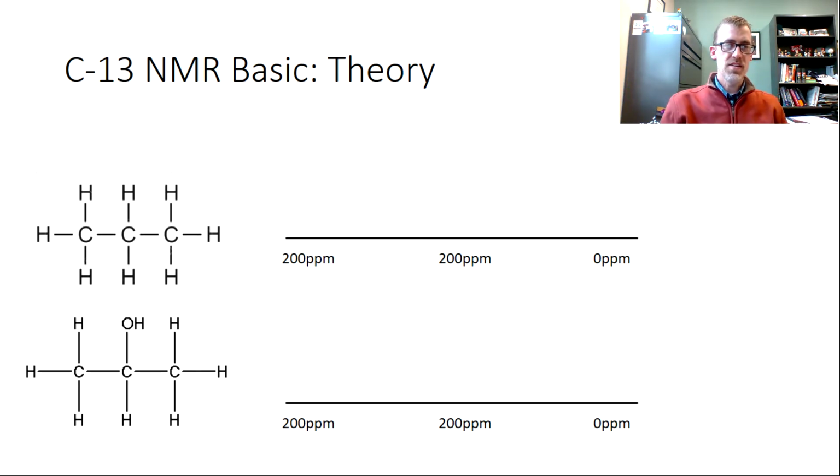So here's the start. I'll talk a little bit about how the instrument works, a little bit of theory for a few minutes, and then we'll very practically look at a couple molecules and see what their spectra would look like, and hopefully that will be plenty to help the lab go smoothly.